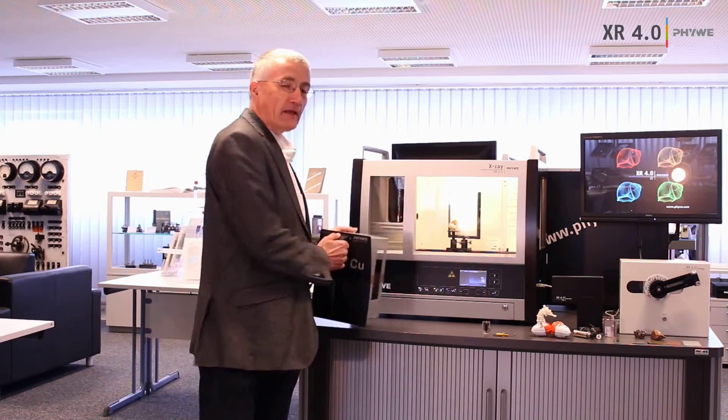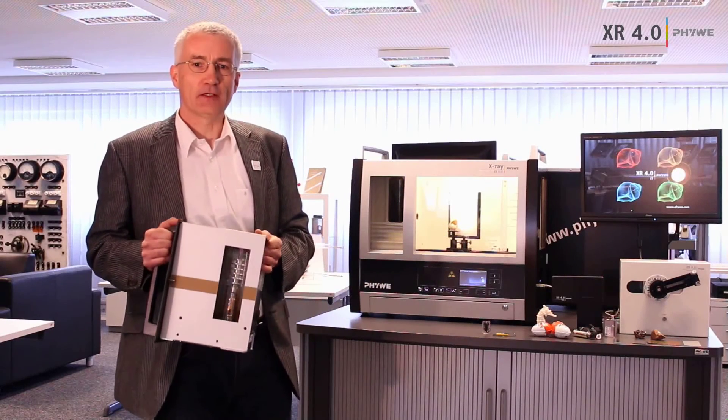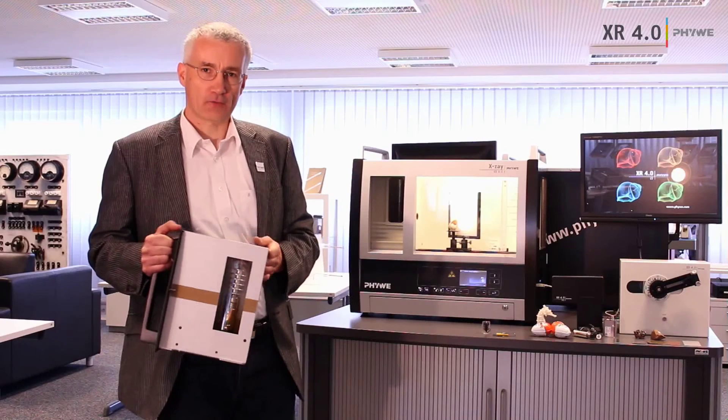Let's look at the instrument. I want to start with the X-ray tube. We have four different X-ray tubes and you can easily replace them with other X-ray tubes.